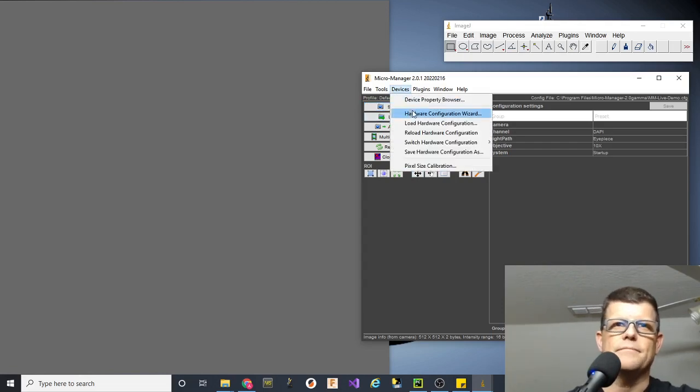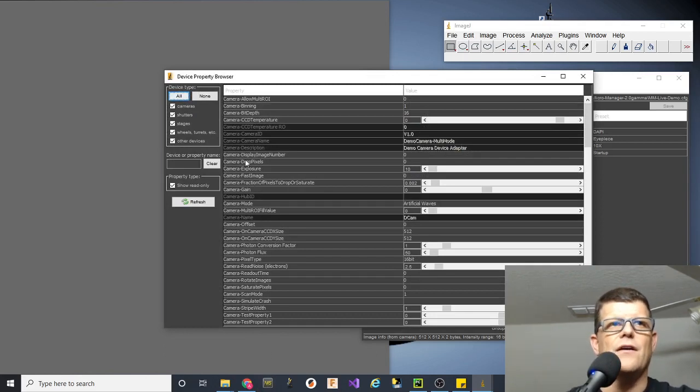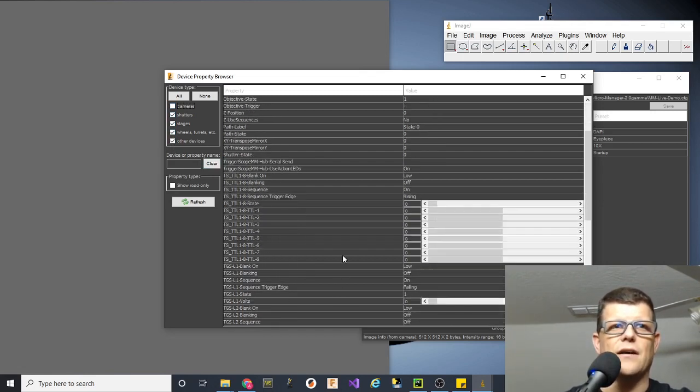What I'll do here is go to this device property browser. This is a lot of stuff, but we can whittle it down a bit. First of all, we'll turn off read-only properties because that's not going to help us much right now. Second, we'll turn off camera properties because I don't need to deal with the camera right now. Pretty soon I see this big bank of TTL stuff.